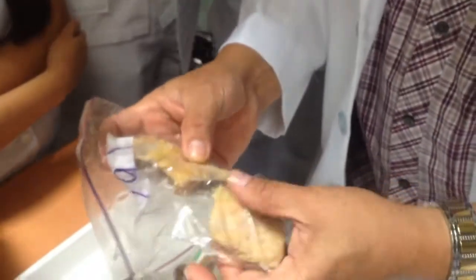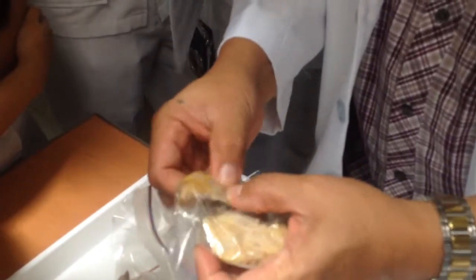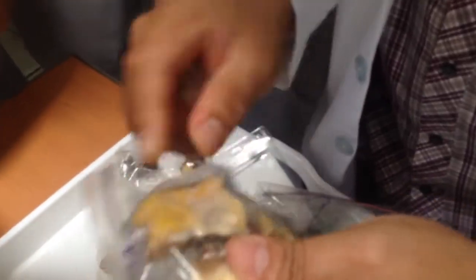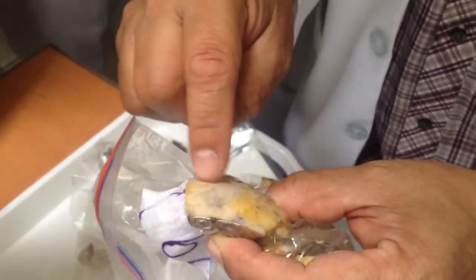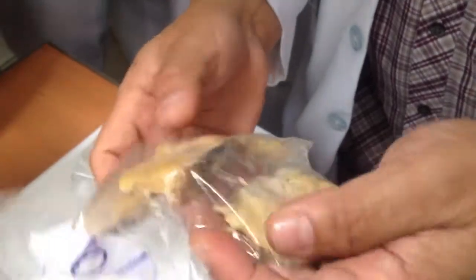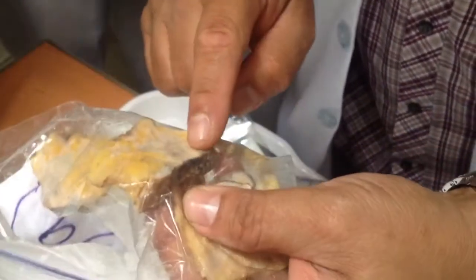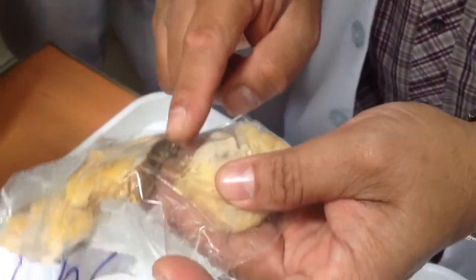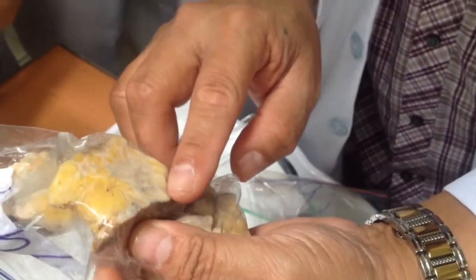This is now invasive ductal carcinoma. It is ill-defined, pale brown, hard, and you have a granular cut surface. It is not lobulated, ill-defined. And those blackish colors are areas of necrosis already. Especially there is already infiltration of the skin. This is the skin, nipple. Infiltrating the skin.